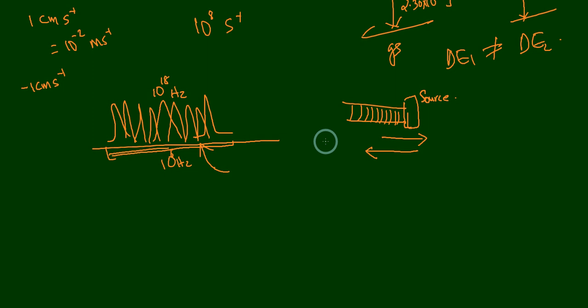In another technique, you can use a loudspeaker coil, like this.